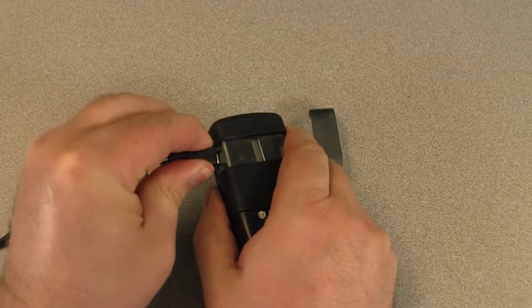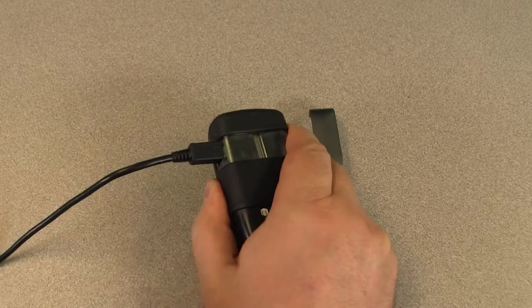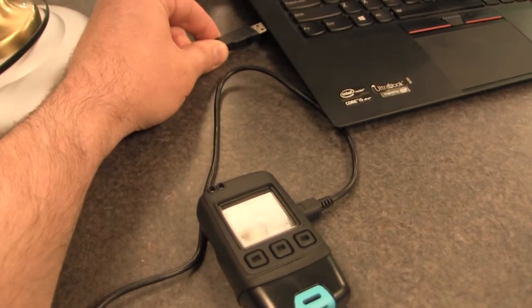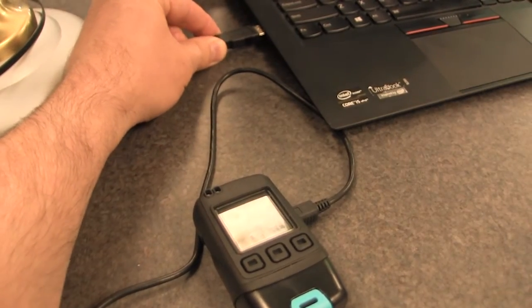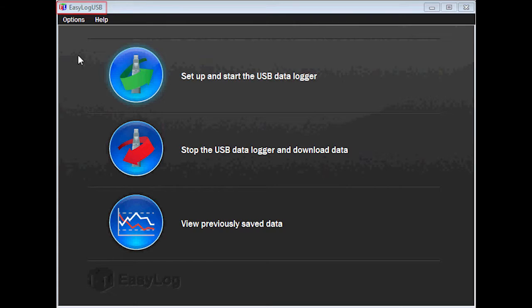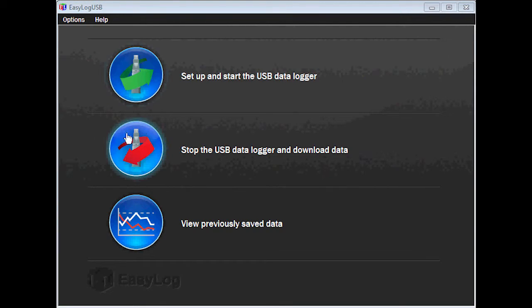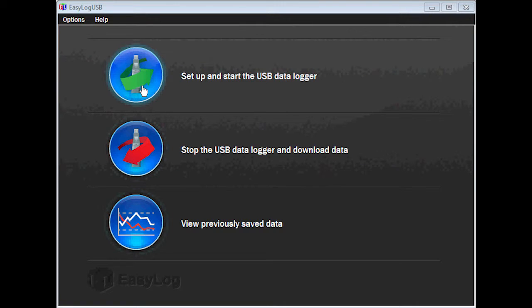After installing the software, insert the data logger into an available USB port on your computer and launch Easy Log USB. After the program is loaded, click on the option Setup and Start the USB Data Logger.